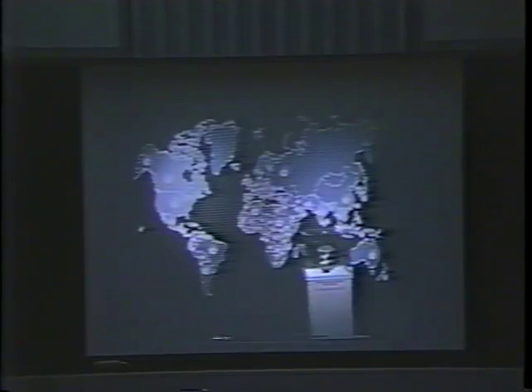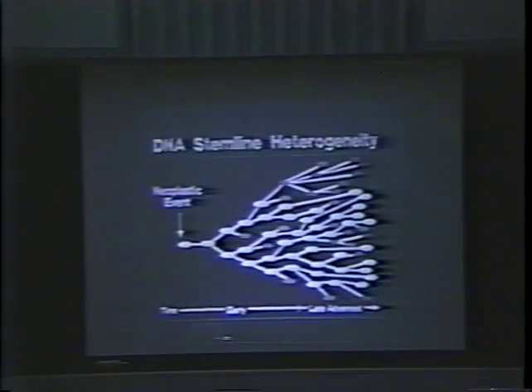Today, cell sorters are being used to study how cells function in the immune system, how infectious diseases arise, and how the body responds to them. Of crucial interest is the immune response to HIV, the human immunodeficiency virus, the cause of AIDS. Cell sorters are also being used to study parts of the cell, especially chromosomes and their DNA content, important for understanding how cancer cells function and for mapping the human genome. This program outlines the story of the cell sorter's development.